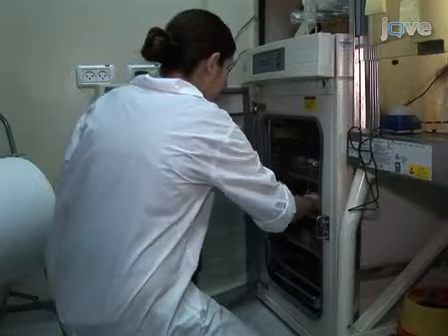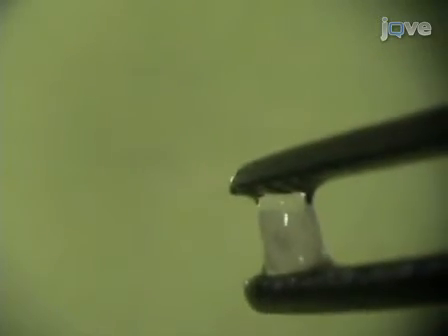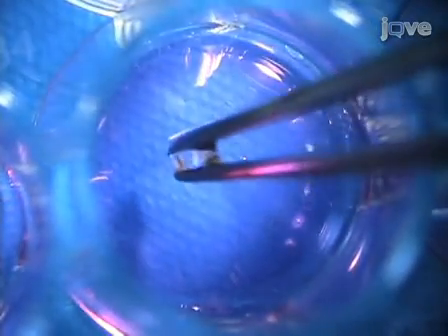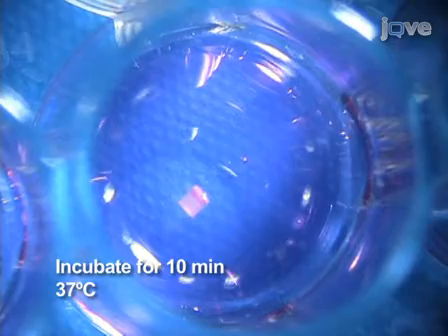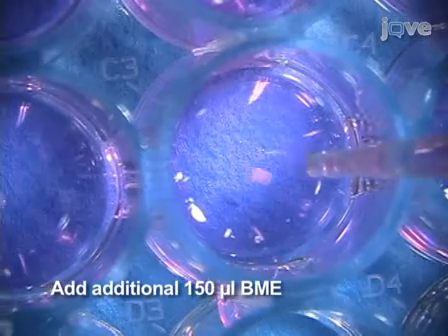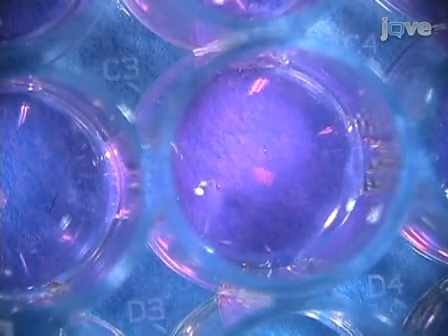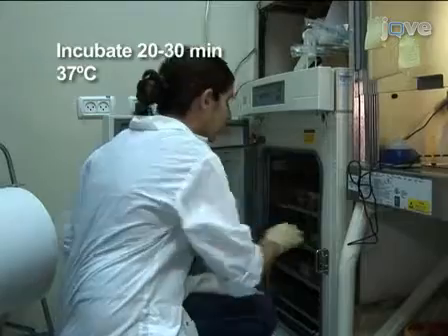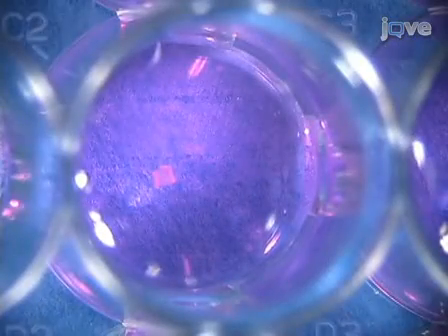Once the BME has solidified, carefully lift out an aortic ring from the petri dish using tweezers. In order to prevent damage, the ring should be transferred inside the drop of liquid that forms between the tweezer tips as a result of liquid surface tension. Place a single aortic ring in the top center of each dome and incubate for 10 minutes at 37 degrees Celsius. On top of each ring, add an additional 150 microliters of BME and incubate for 20 to 30 minutes at 37 degrees Celsius. The ring is now encased in BME and assay materials can be added to the plate.